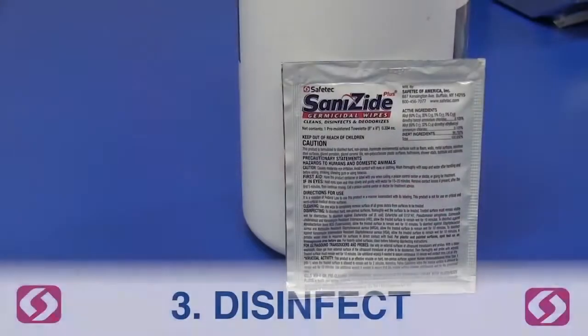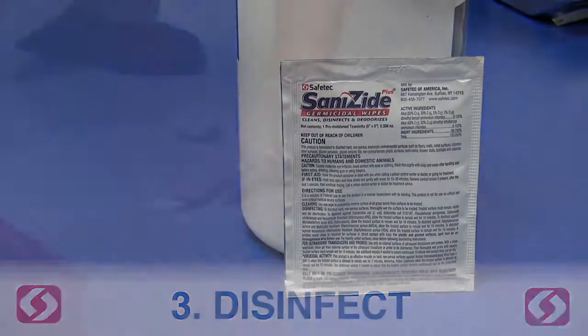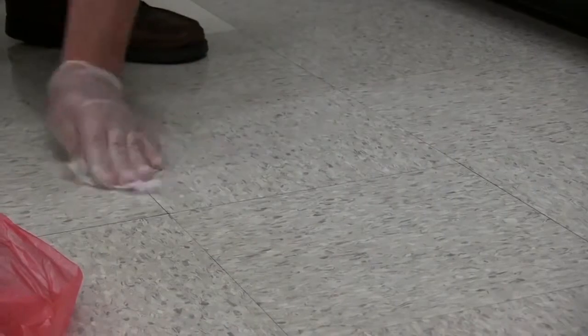Disinfect. To properly disinfect the contaminated surface area, use the Sanizite germicidal wipe. This process is critical for preventing any further contamination.